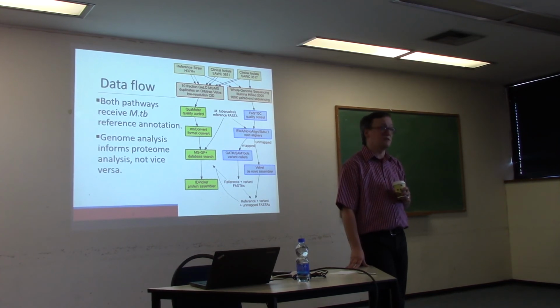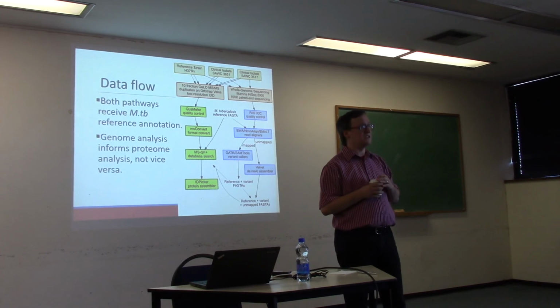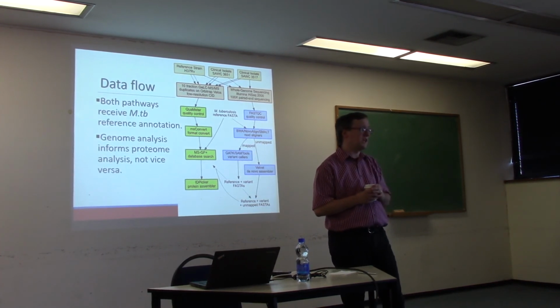No, we were going to get the ones that are expressed when everything is on. I think in this case we saw approximately 2,000 proteins, which is not the full 4,400 that we could get. But the other question was, is the mass spectrometry we're doing here capable of the same sensitivity that we could get if we were doing fractionation in labs that use it routinely? And I think the answer there was no.